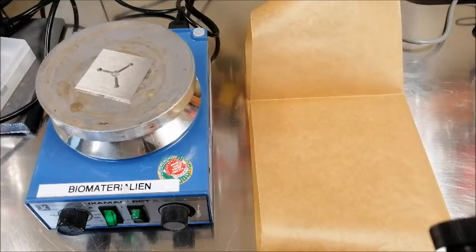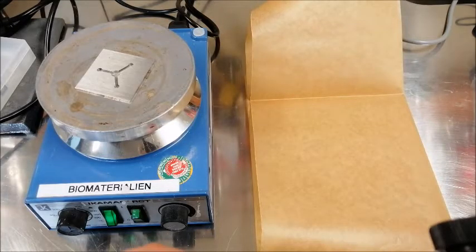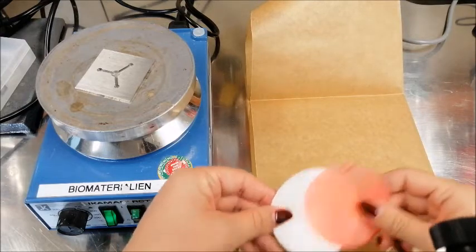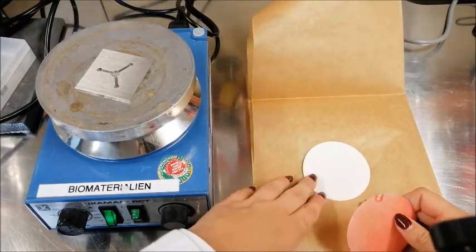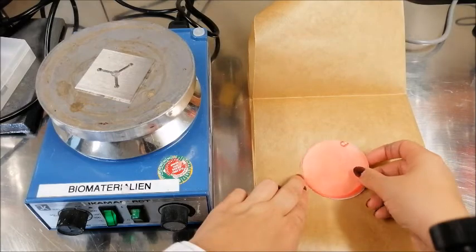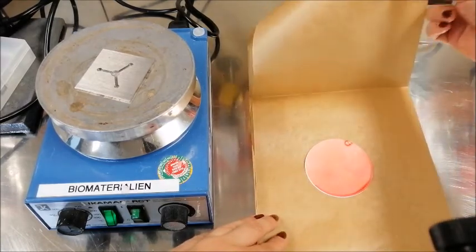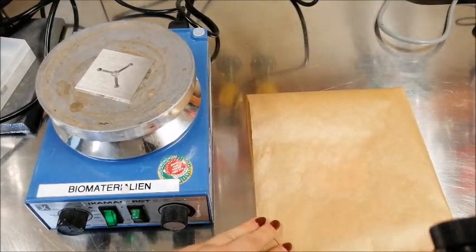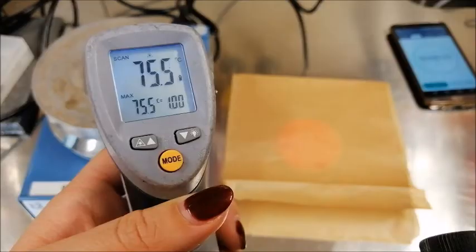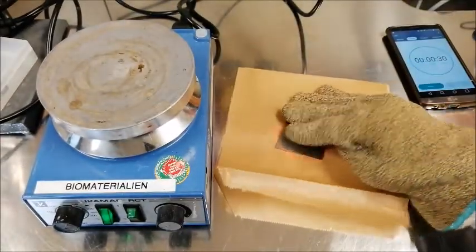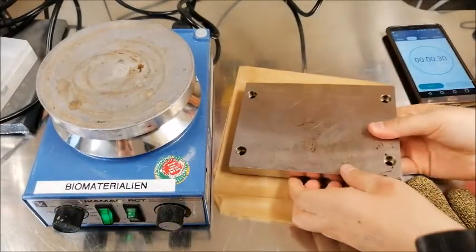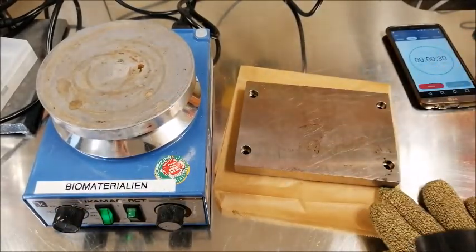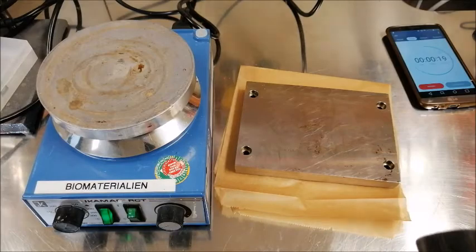The technique used for creating the device is called hot embossing. A nitrocellulose filter paper soaked in wax is placed on another filter paper. Then, a heated metal template is placed directly on this construct. After applying a certain weight, it rests for a given period.